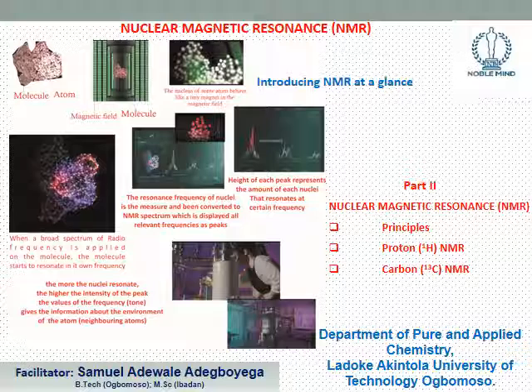Okay, by the time you introduce a broad spectrum of radio frequency, you may call it radio frequency wave, when it's applied on the molecule, due to the presence of nucleus, which were already behaving like a tiny magnet in the magnetic field, introducing radio frequency allows the molecule to resonate in a frequency equal to the frequency being introduced.